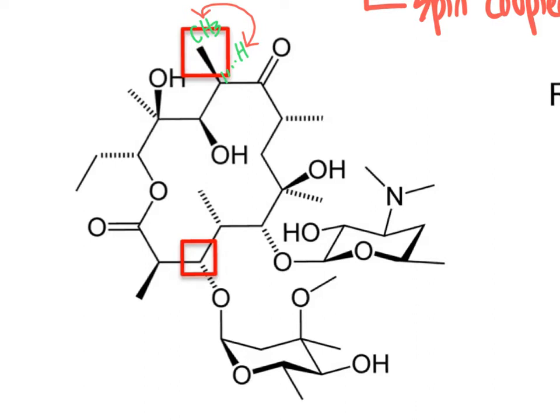Thinking about that same carbon atom, what would we expect to see in terms of the HMBC correlations, heteronuclear multiple bond correlations, from this proton to carbon atoms? We're going to see correlations to carbon atoms that are separated by 2 to 4 bonds. So here, a 2-bond correlation would be to right here, because we have 1 bond connecting the carbon to the hydrogen and then another connecting carbon to carbon there. So that would be a 2-bond correlation. That is the only 2-bond correlation. If we come over to here, this would represent a 3-bond correlation.